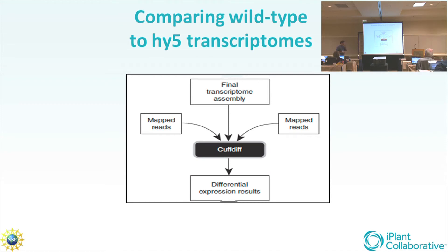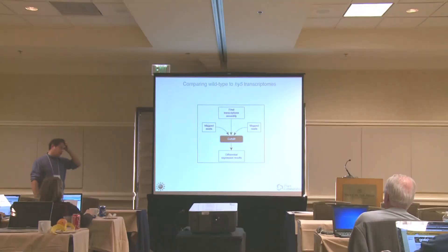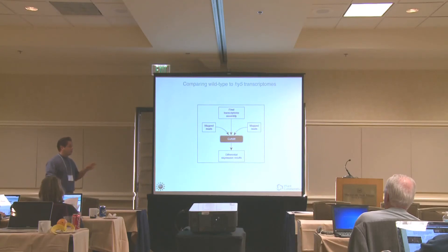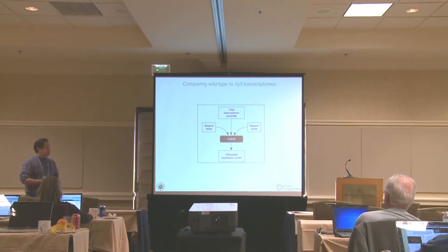Now we're running Cuff diff, which is in many ways similar to Cufflinks - it does transcript assembly and quantification, but also does a comparison. To compare different transcriptomes derived from different sequencing runs, it first merges the replicates, with differences between replicates incorporated into the test statistic. It also has a setting for false discovery rate analysis that calculates a more rigorous p-value called a q-value, which takes into account multiple trials. The p-value cutoff is 0.05, and the q-value cutoff is also 0.05 but much more stringent, and that gives us our differential expression results.